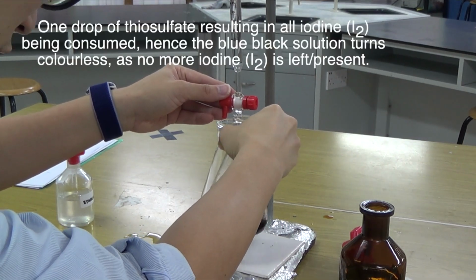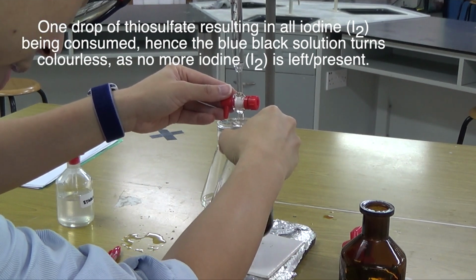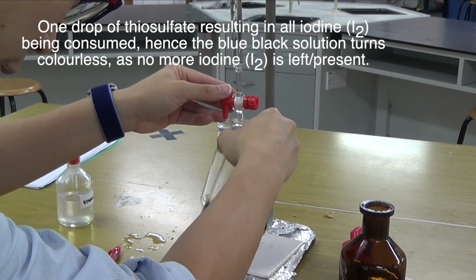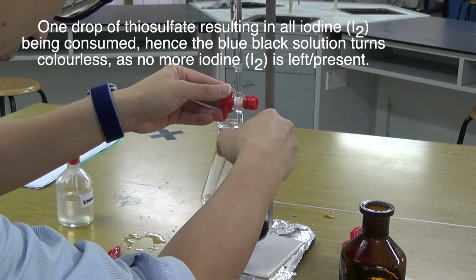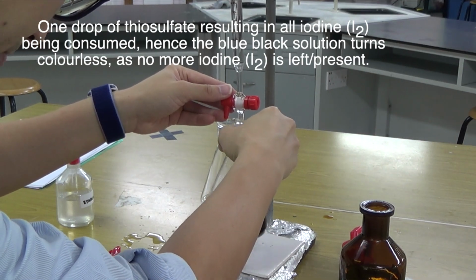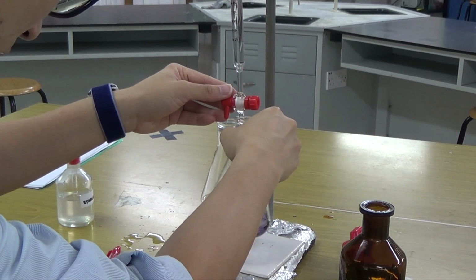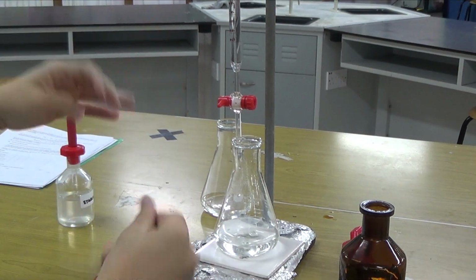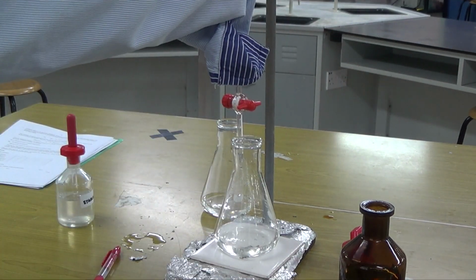So eyes, do not take your eyes off the conical flask. Don't even bother with the reading because you are doing an exact titre, so you can read the reading later on when you reach the end point. And don't take your hands off the tap as well. So one hand on the tap and one hand swirling. You don't need to swirl that strong, but one drop will give you the colour change. I think the next drop should give me the colour change. So pretty sharp, and then I stop straight away. Okay. So now I'm going to reach my end point.